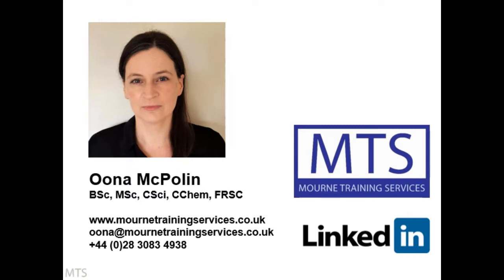In terms of HPLC, I have used it as my primary technique for over 25 years now. And I think one of the challenges that I had at the beginning of my career is how do you go about developing methods, where do you start, and what way will you attack it? So in my courses, and today, I'm going to talk about strategies, trying to deal with that, trying to make it easier.